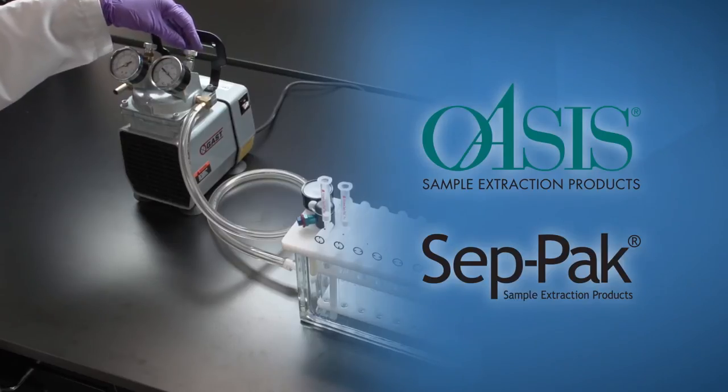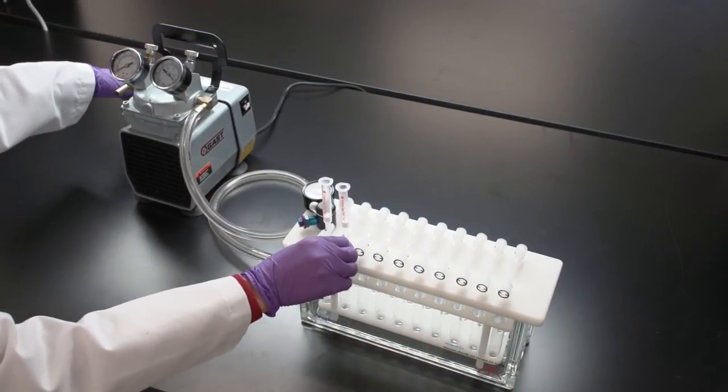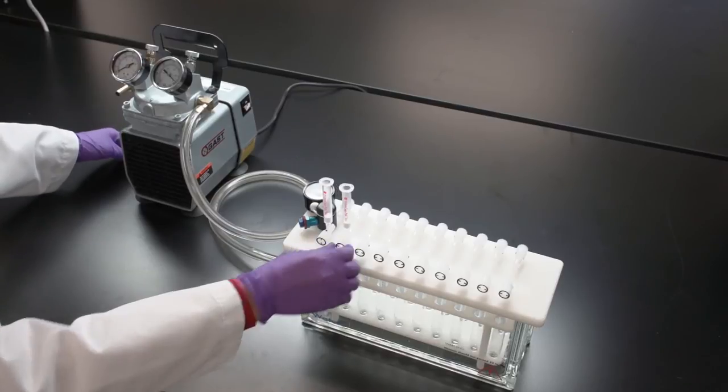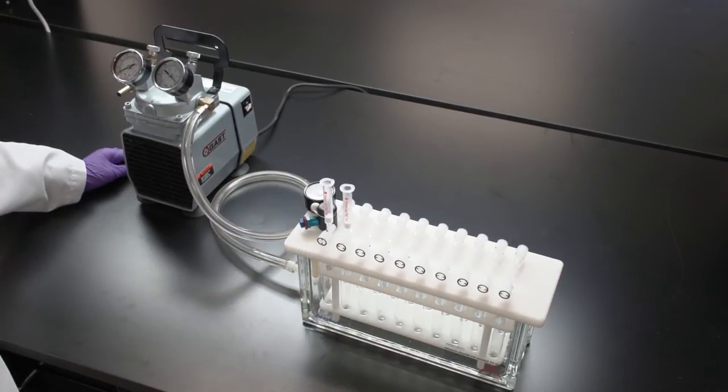Once all the liquid has been drawn through any given cartridge, turn the respective stopcocks to the closed position to maintain vacuum for other cartridges.